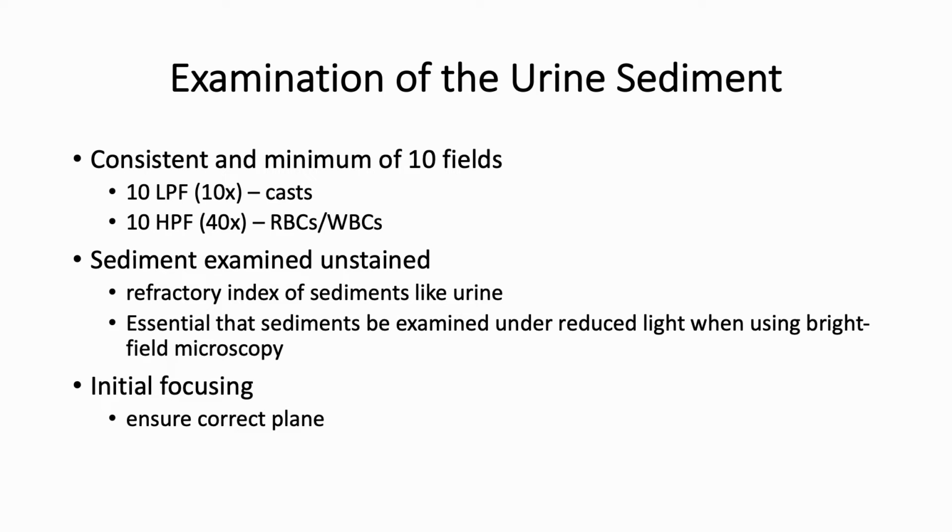The initial focusing can be difficult when examining a fluid specimen, and care must be taken to ensure that the examination is being performed in the correct plane. Often, an epithelial cell will be present to provide a point of reference, and focusing on artifacts should be avoided because they are often larger than the sediment elements and can cause the microscopist to examine objects in the wrong plane.